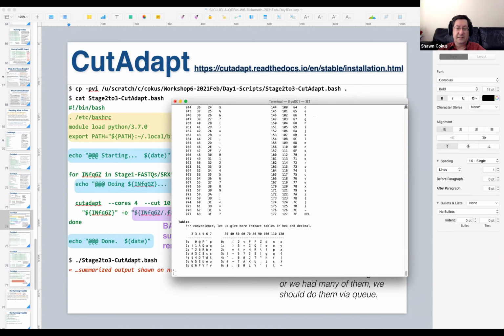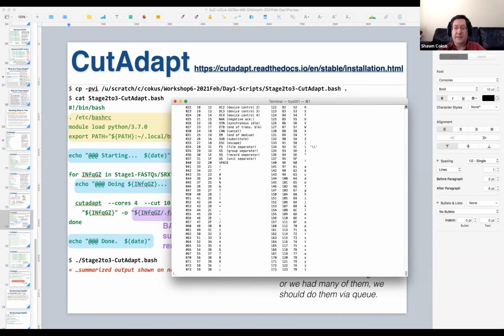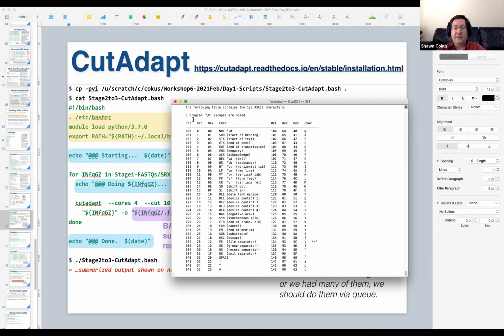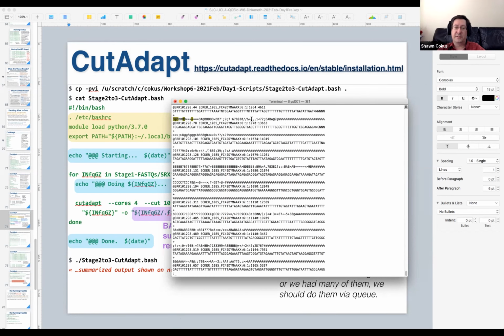Capital B. What's capital B? So that is a decimal 66. If the shift was 33, 66 minus 33 is a 33. So actually, capital B is a score of 33. Otherwise, in the 64 shift, it's a score of 2. It's not quite sure. Anyway, with enough examples, you can figure out what scale you got and so on. It's not really important to us right now.